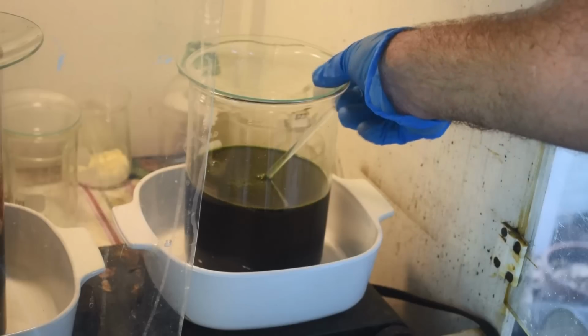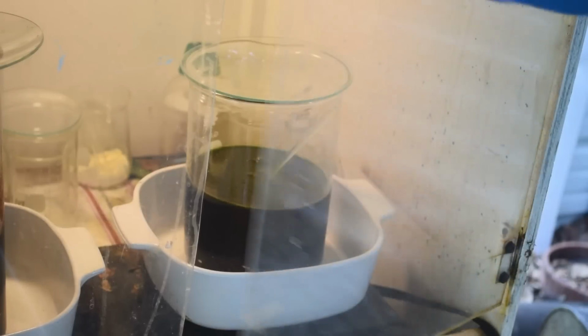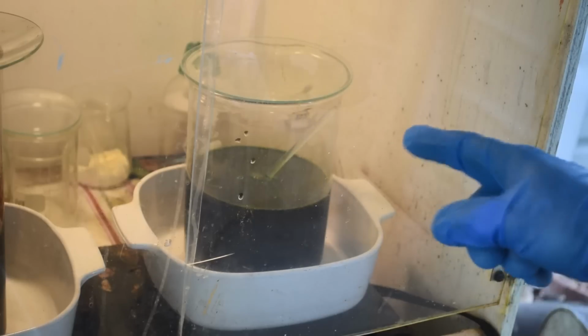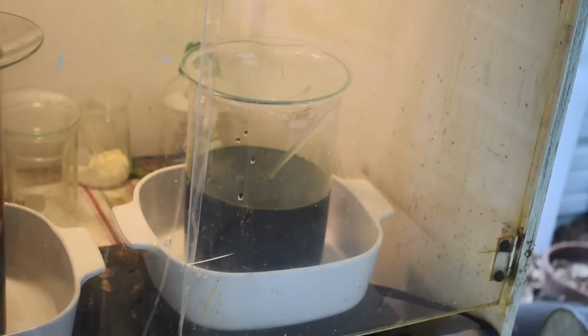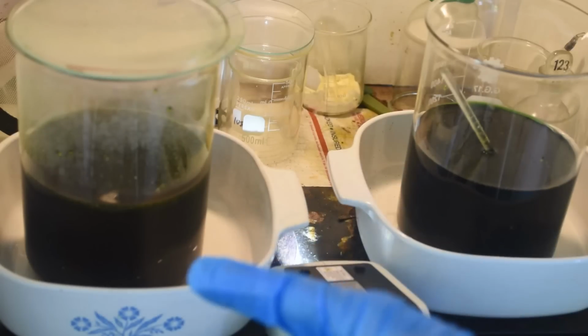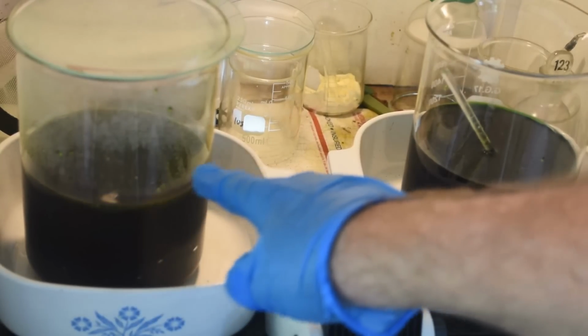Keep the chlorine gas that's generating in, and we'll check on that again in a few seconds and see if we start seeing a red precipitate. Yeah, some of this stuff's more concentrated than others. Some of this stuff's been diluted more. So, definitely something happening in there. Hopefully we'll start getting that red precipitate soon. If not, I'll put a little bit more in, but I'm going to wait for that reaction to stop first. I don't want it to take off like a volcanic eruption. Okay, I have moved the one from over to here, and it's not obvious that anything has happened, but there is a red scum around the top here.